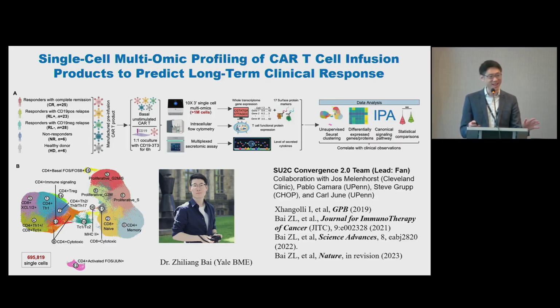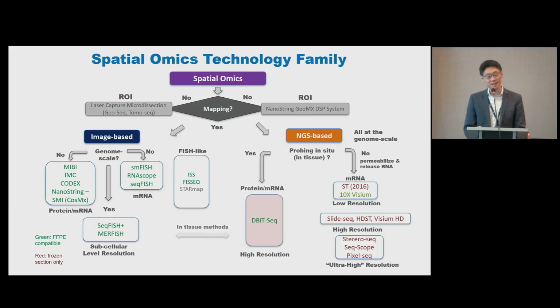But anyhow, I still have not talked about the second aspect I mentioned at the very beginning. For the tumor microenvironment, single cell resolution is required, but ideally you want to look at that directly in the tissue context. People realized that challenge a long time ago, but were still quite limited by the tools available. About 10 years ago, this whole field started to emerge called spatial biology. Back then, I co-organized a seminar series with Ahmed Koska, who I believe is speaking today as well. We were debating the title of that seminar series, and I told Ahmed we should call it Spatial Omics, not spatial genomics or spatial transcriptomics. I never thought I was going to develop another spatial transcriptome technology. Let's make the family as broad as possible.